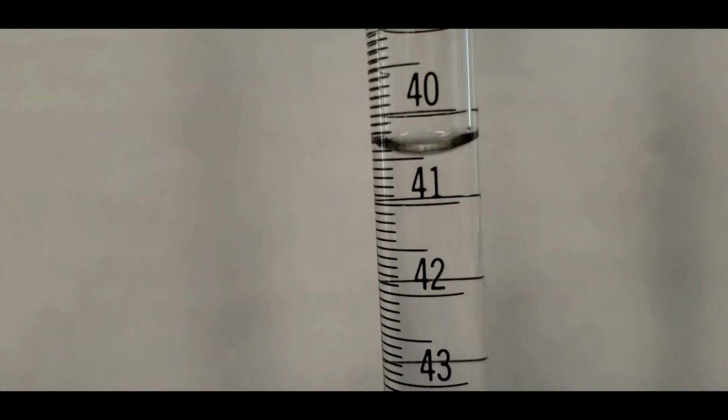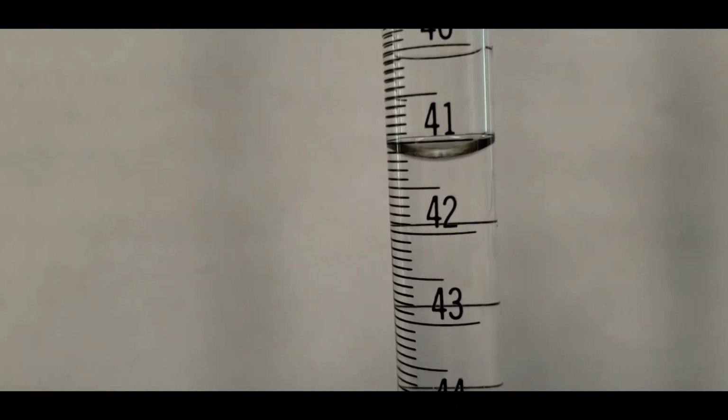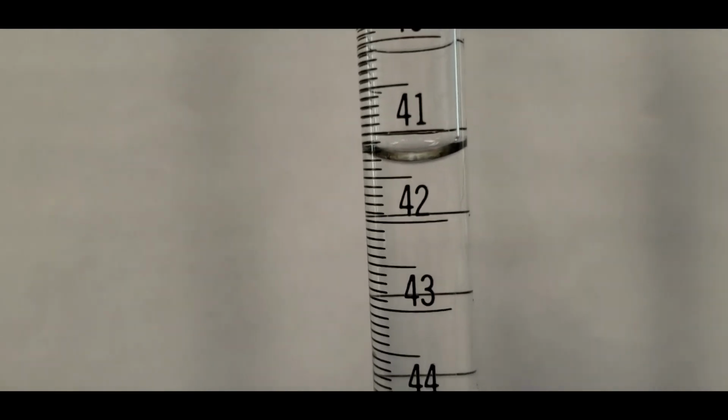And you can also estimate in between those lines. So when you're done with the titration, if it's in between those lines, you'd add in the hundredths place as well. So we'll do that when we do the actual titration, but that's what it looks like.